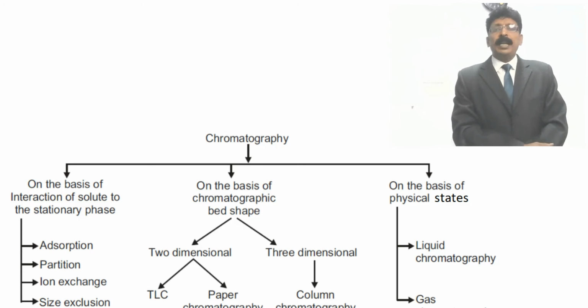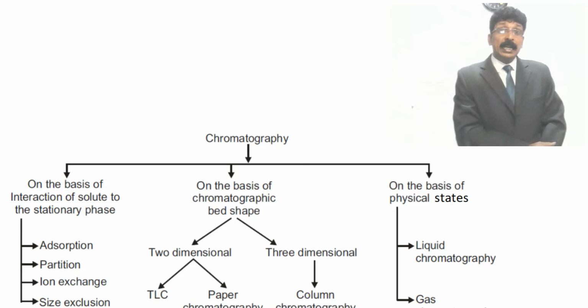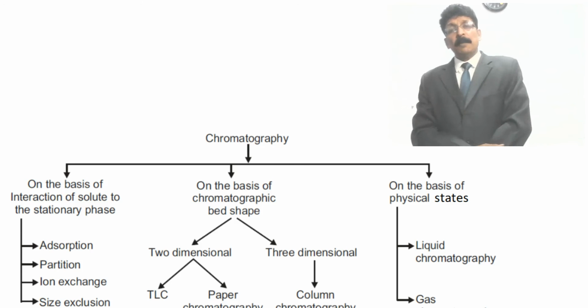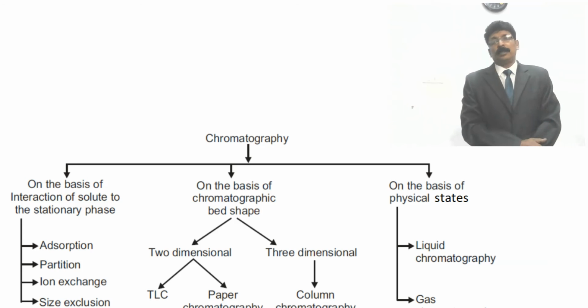Specifically, commonly everywhere they will be saying adsorption and partition chromatography. Apart from that, there are many. The basic separation reaction between the stationary phase and the mobile phase plays the major role in separating many types of chromatographic techniques.